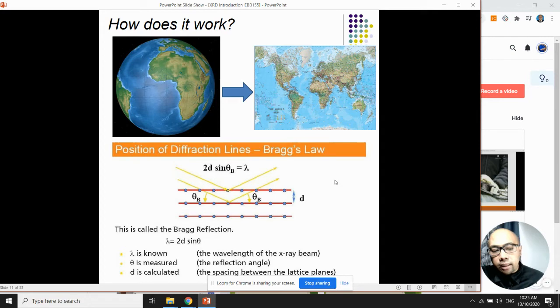Let's say you have powder. Powder is in a 3D form, right? So how do you want to see the whole pattern of the solid that you measure? This slide shows that, imagine you have the crystalline material as a 3D form, and you need to fold it until you get a 2D view to see the pattern.